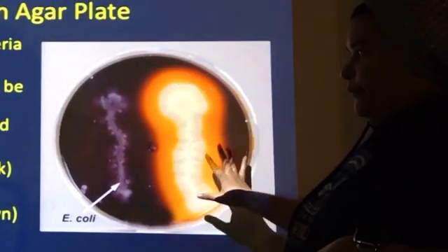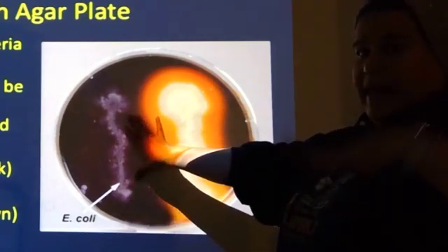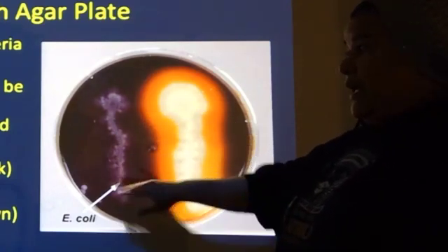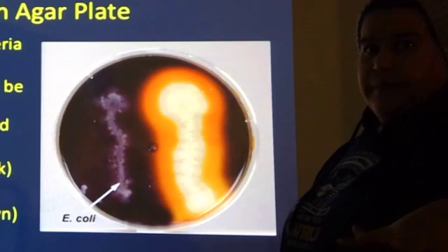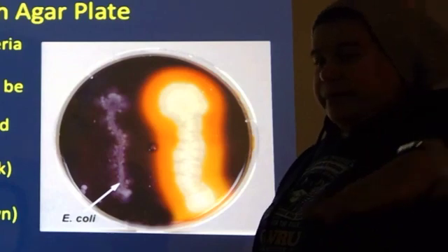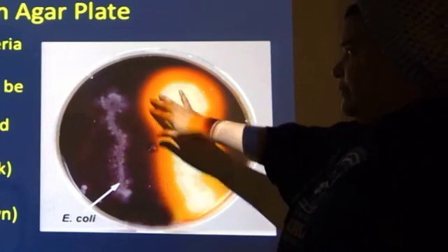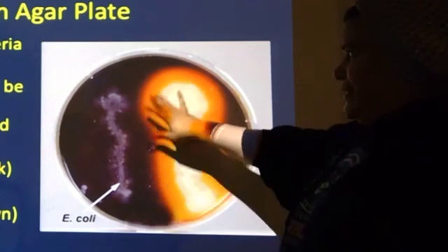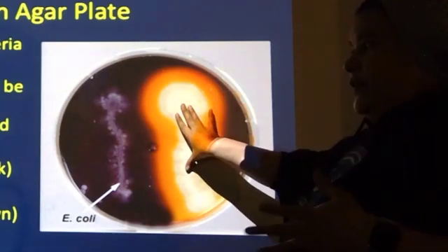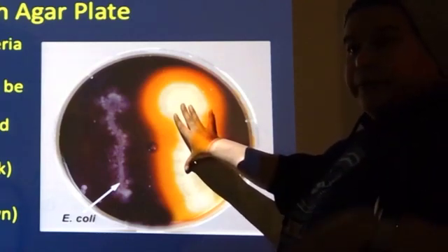Looking at this example, I've got one type of bacteria, clearly it's there, that when I add iodine to the plate, it's black. This means that E. coli can't do starch digestion. Since there was starch right next to these colonies, you're done. However, if you look at this example over here, you'll notice that the area around it is actually amber, the color of the iodine. So this particular bacteria, whatever it may be, is actually able to digest starch.